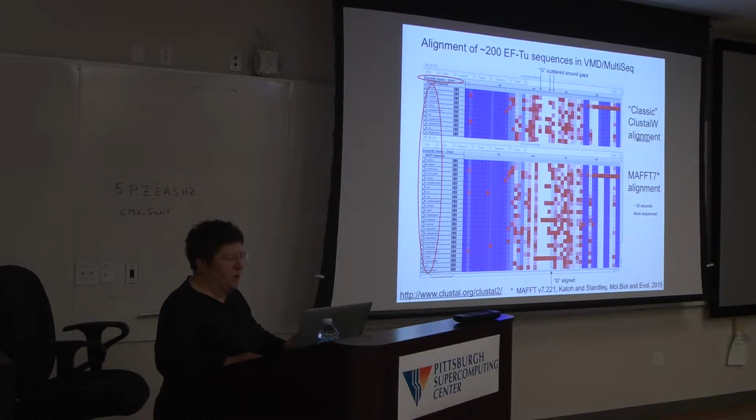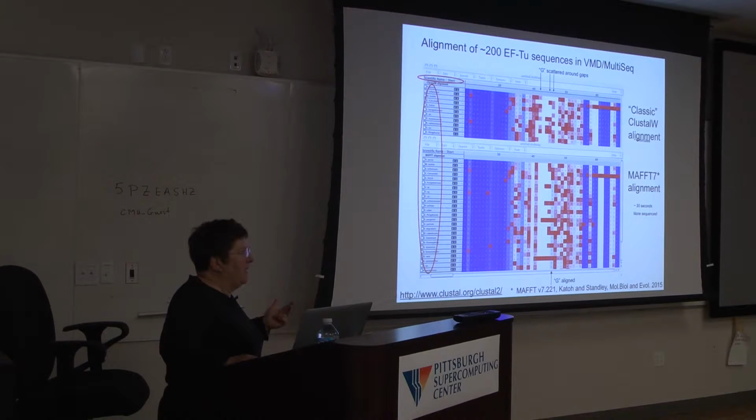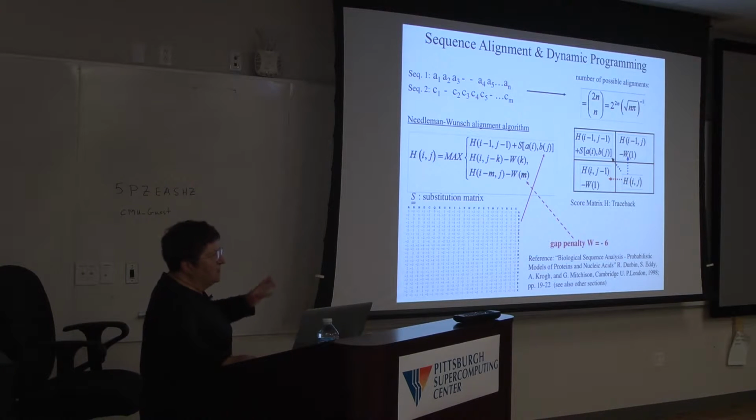Okay, so what's important, you'll see later, are the names that come in here. I like to have it also put in some grouping that's all flexible. You can give a short name if you want. So when you're downloading that metadata, it comes in with the official name, the EC number, the common name, the organism, but you can make up subheadings yourself, but be sure to save it. Okay, now that's a multiple sequence alignment.